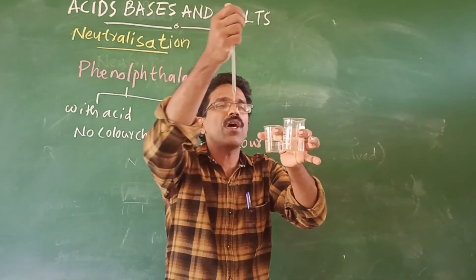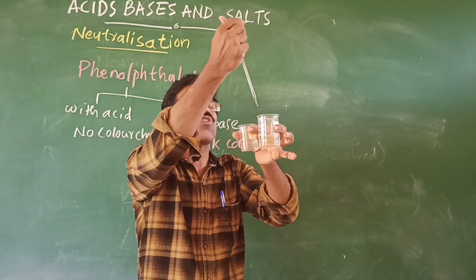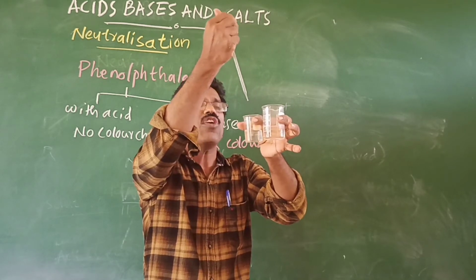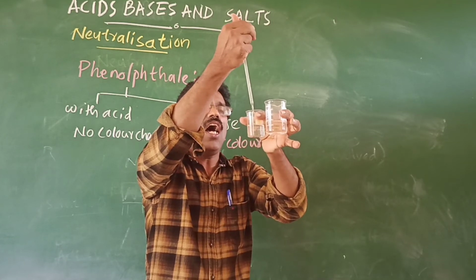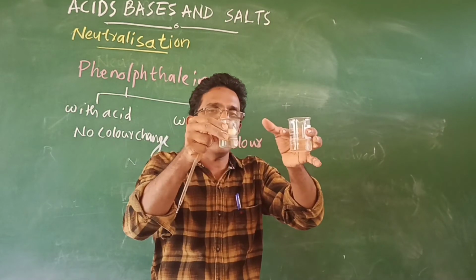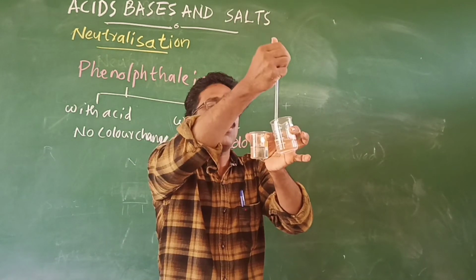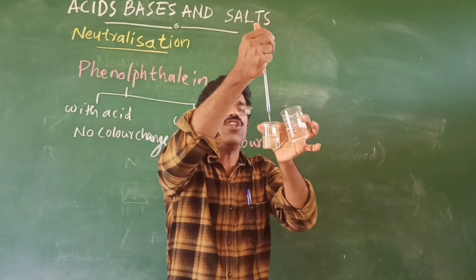Using a dropper, I am going to add this dilute sodium hydroxide into the mixture. Continue adding, and after adding you have to shake the mixture well.